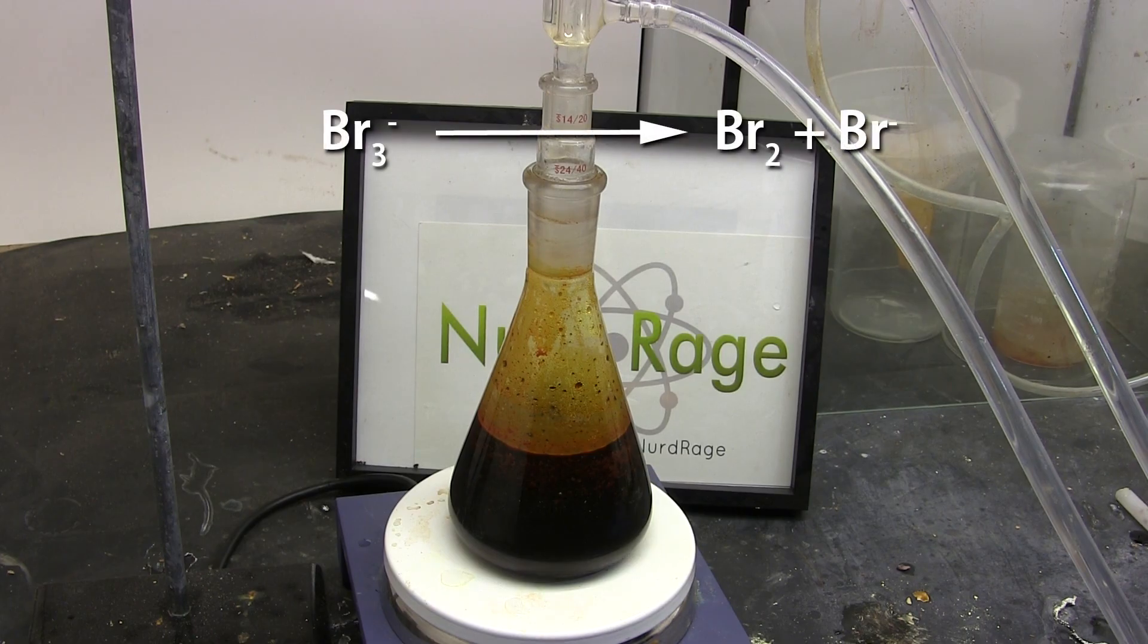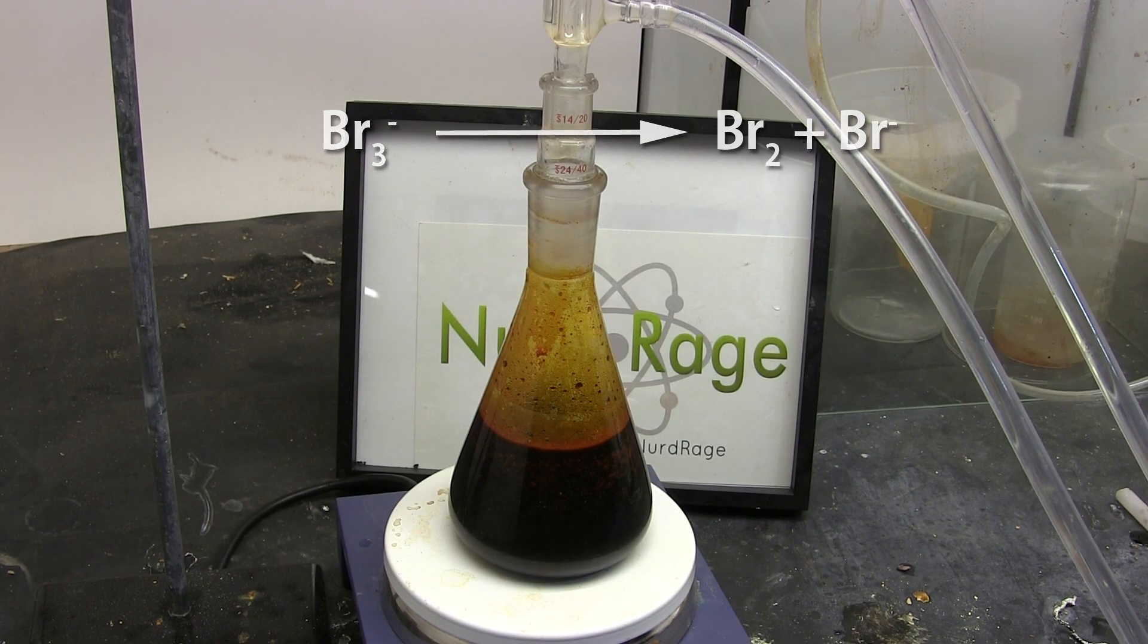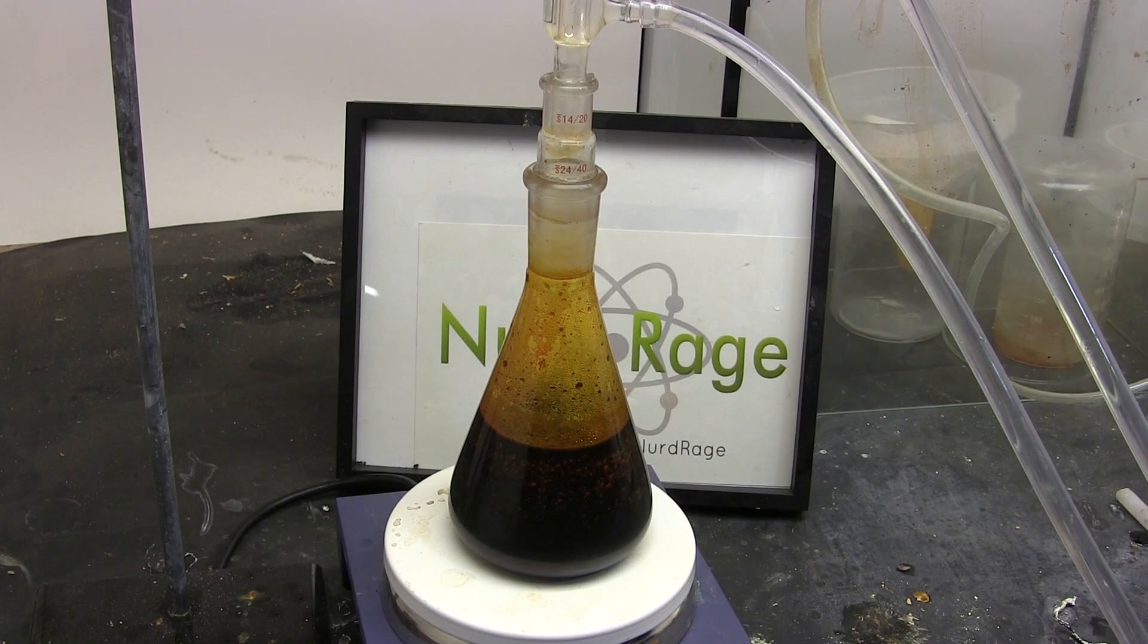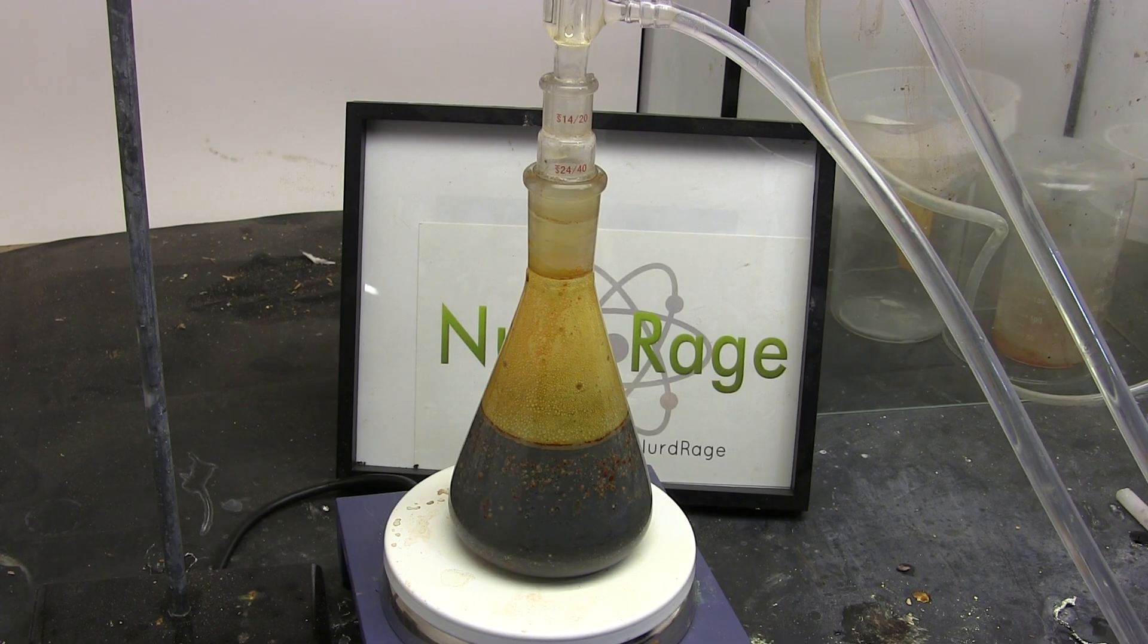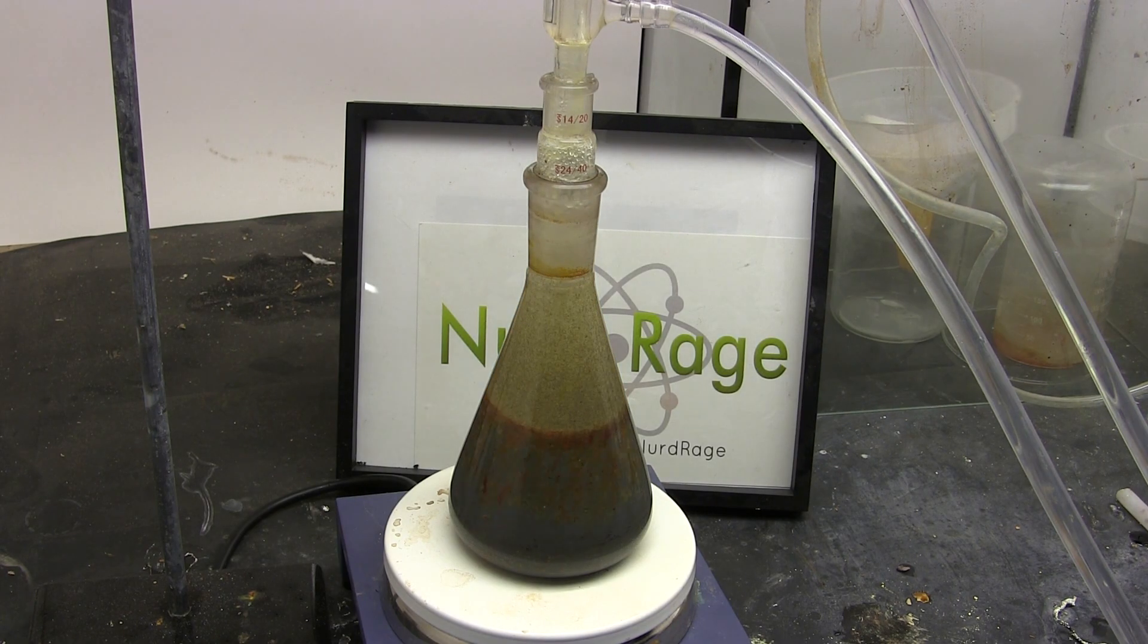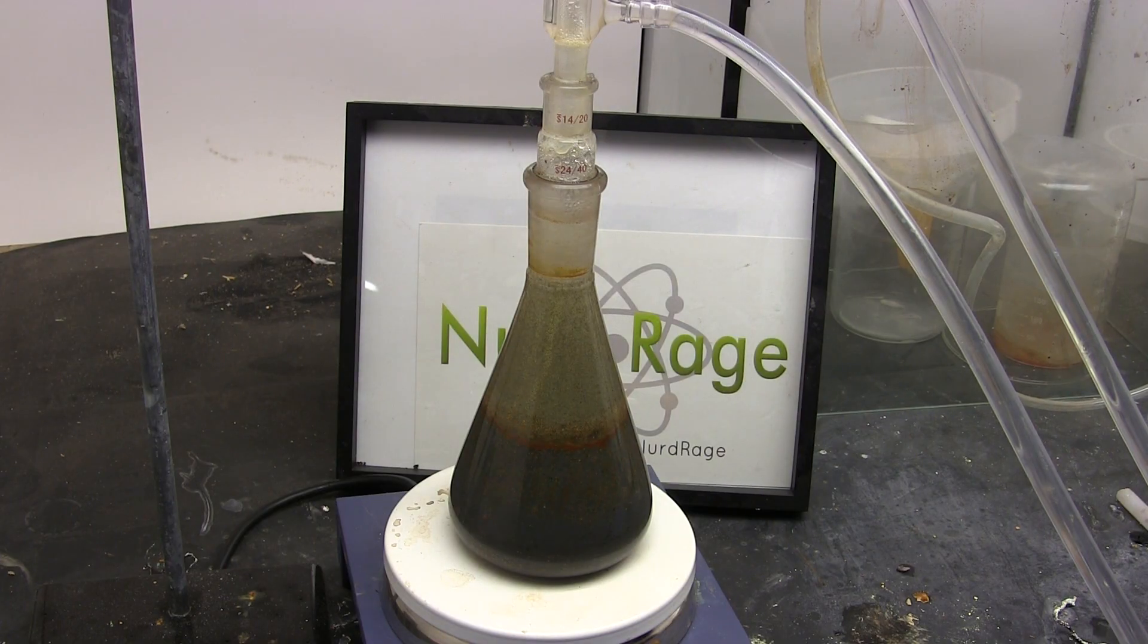What's happening here is that we're dissociating any remaining tribromide ions into bromine and bromide. We're also forcing any sulfur bromides to react with water and produce sulfuric acid. This reaction is very quick and you should only need to reflux for about half an hour to use up any remaining bromine.